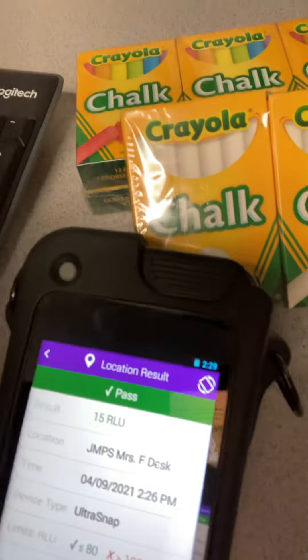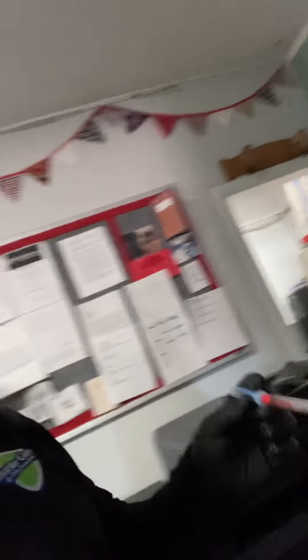Wouldn't it be cool to know that your desk was food safe? Check this out. It was 15 RLUs on this desk. And here is the copier — I just swabbed it.